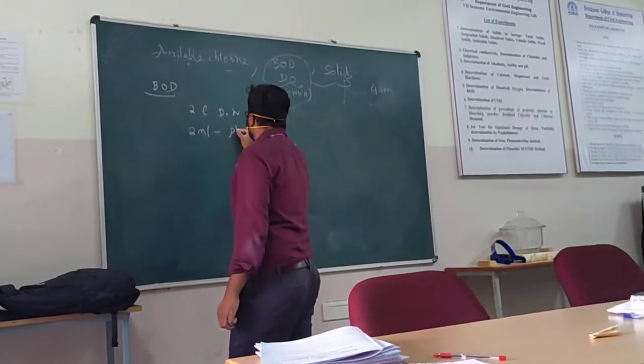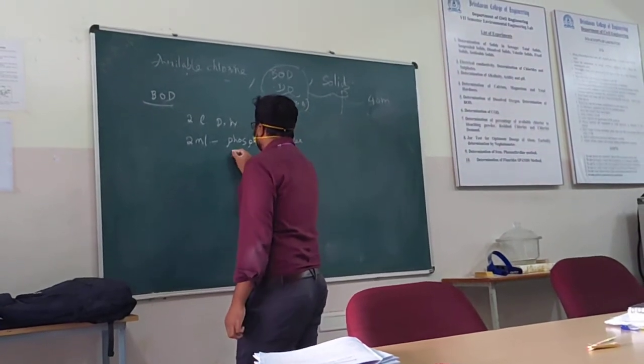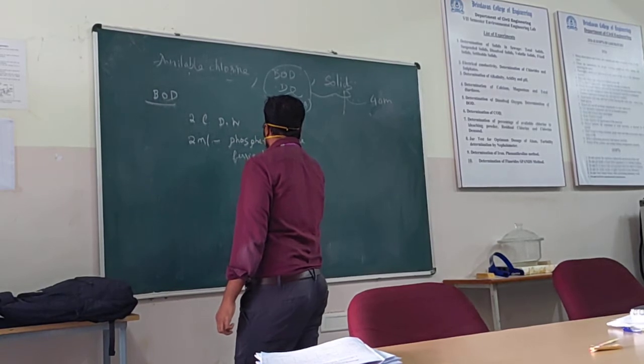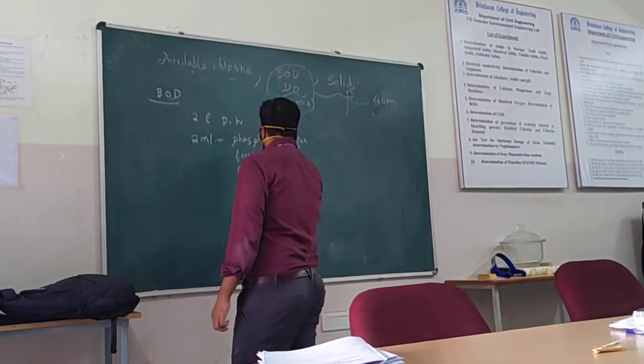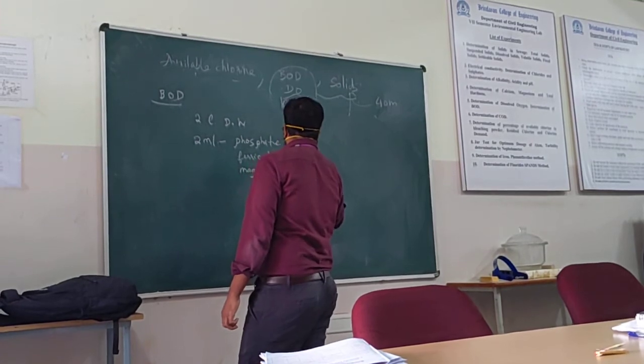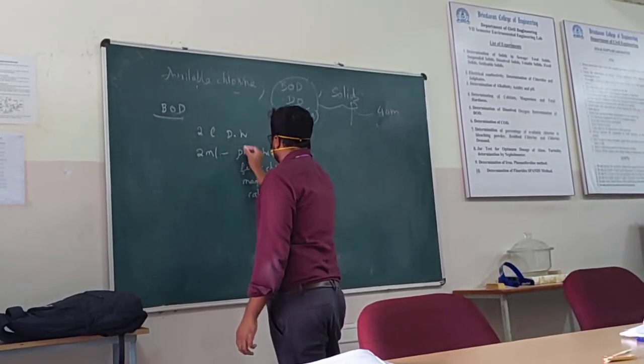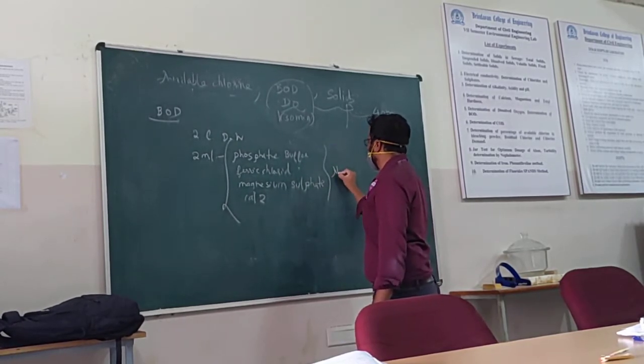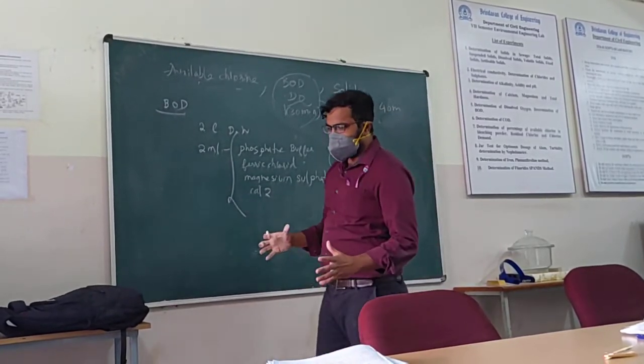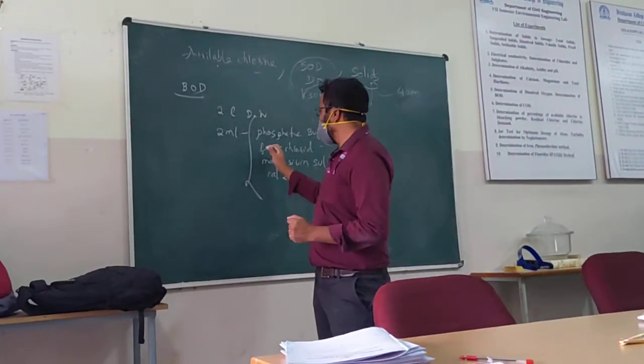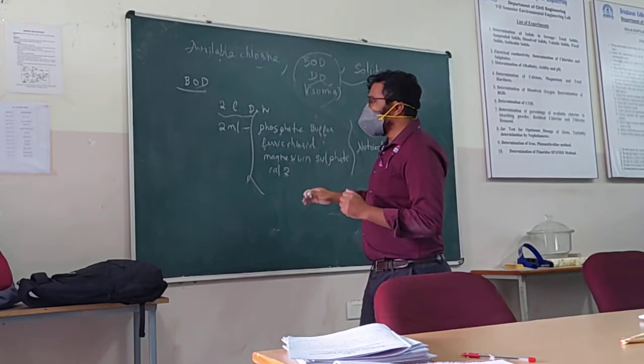Those are phosphate buffer, ferric chloride, magnesium sulfate, and calcium chloride. These four are nutrients. So I am just preparing this sample to test the BOD. I am going to take 2 ml of all these things and dissolve into 2 liters to prepare the solution.